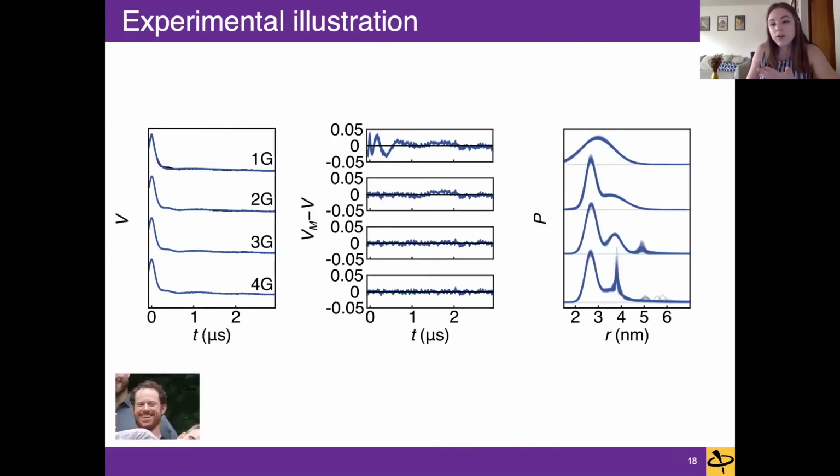So finally, everything up to now has been synthetic data, and that's nice because you can have a ground truth, and from that you can know generally what number of Gaussians is going to be most appropriate. But when we're working with experimental data, we're not quite so fortunate. So we need to talk about checking whether a multi-Gaussian model fits the data and comparing the quality of models across multi-Gaussians.